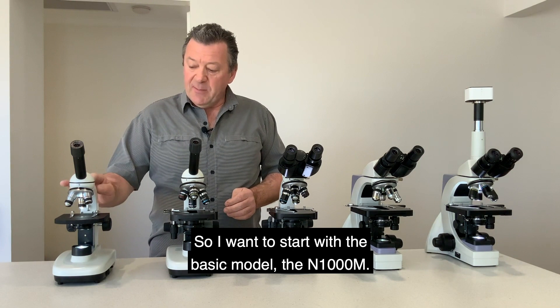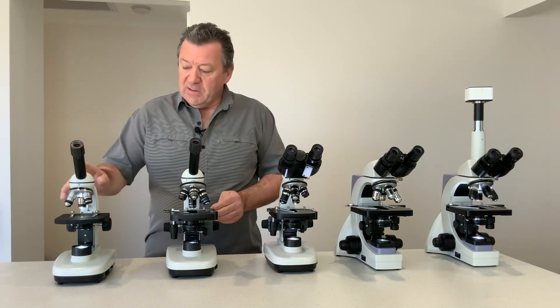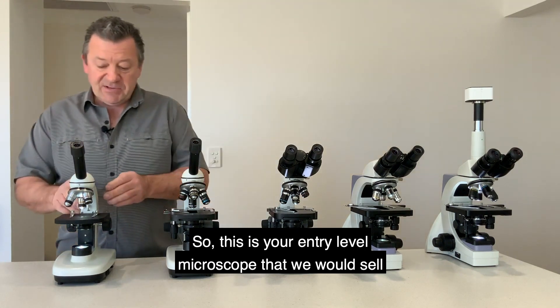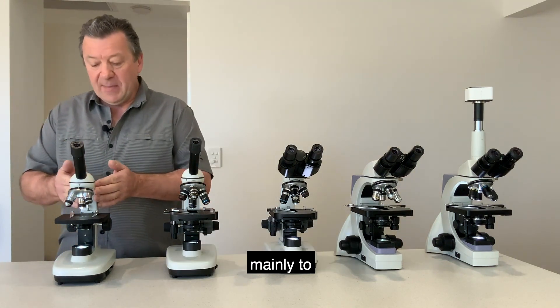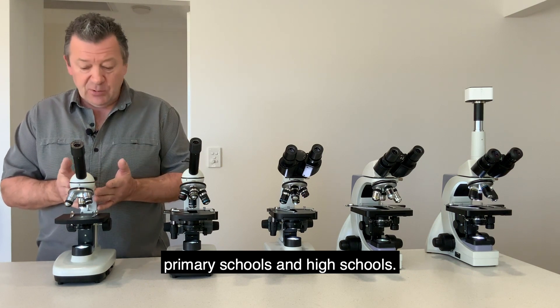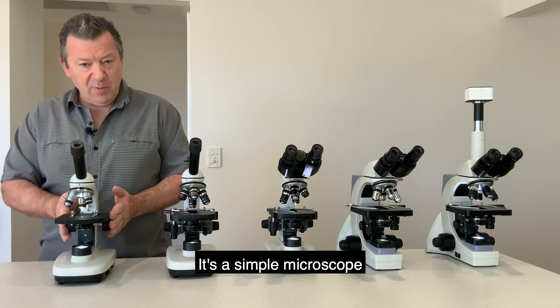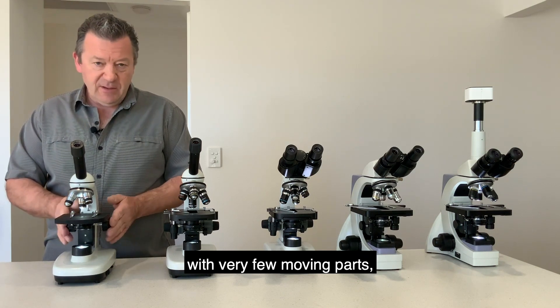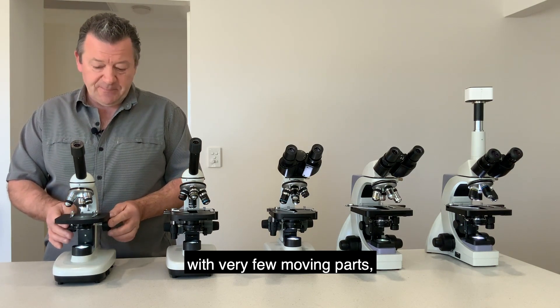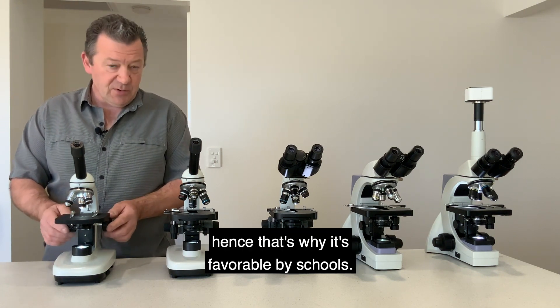I want to start with the basic model, the N1000M. This is your entry-level microscope that we would sell mainly to primary schools and high schools. It's a simple microscope with very few moving parts, which is why it's favorable for schools.